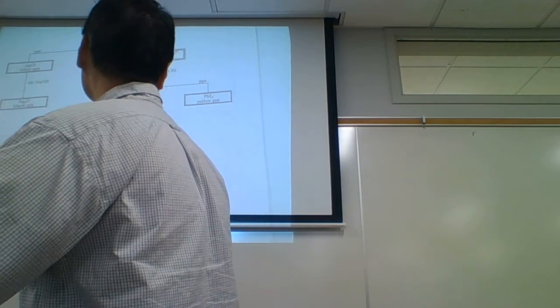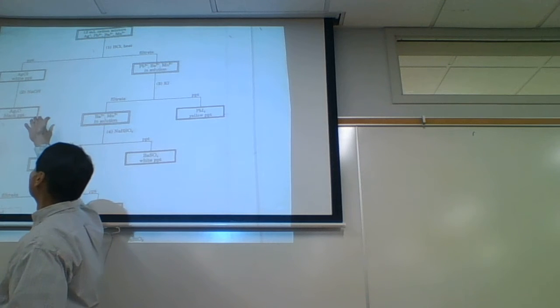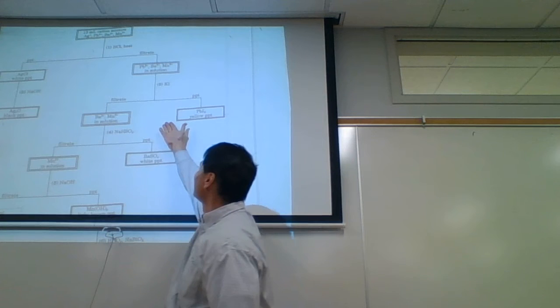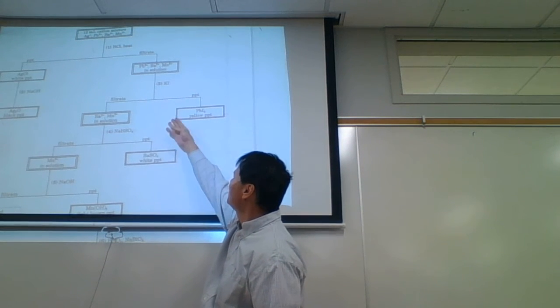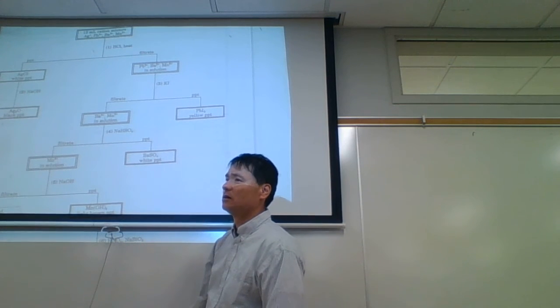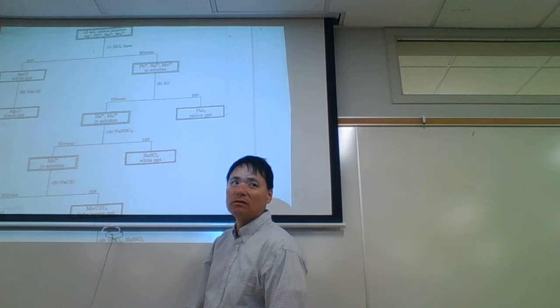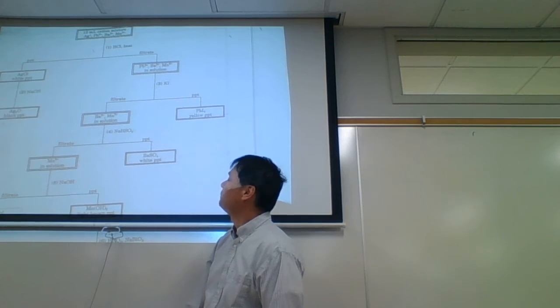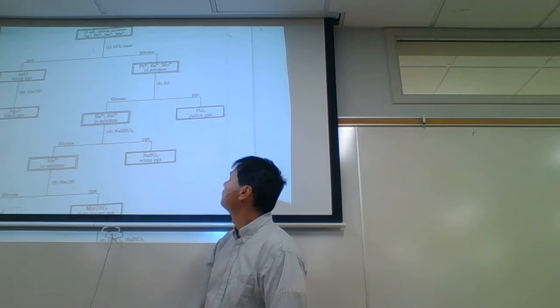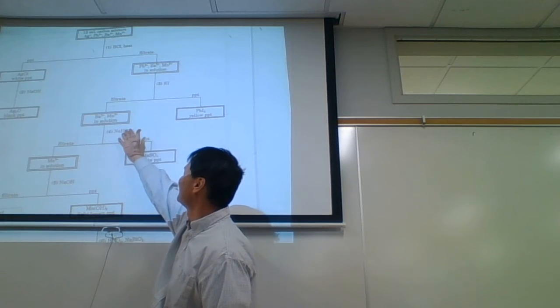Okay, so we continue down here. If you have silver, great. You're going to go through and then test the precipitate with sodium hydroxide. It's going to turn black. Then we're over on this branch here. And in this branch, what is the purpose of adding the KI? To get a yellow PPT. That's the purpose of adding the KI. If we get a yellow PPT, then we can separate. If we don't get a yellow PPT, then we continue down here.